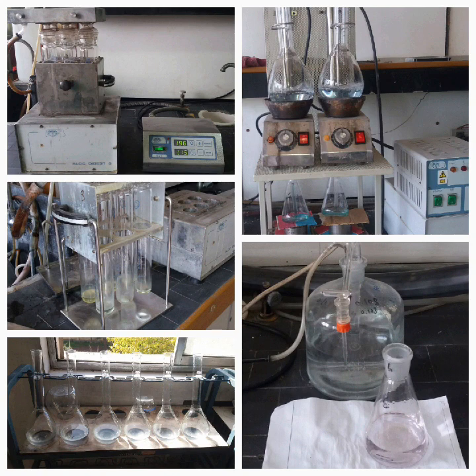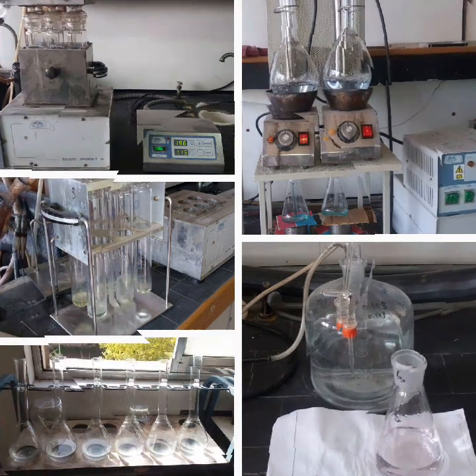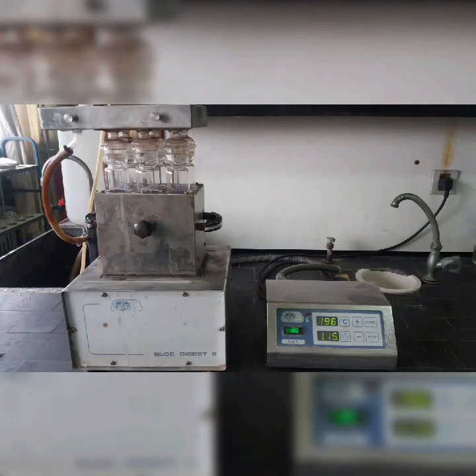Let's dive into the first stage, digestion. Imagine dropping your grain sample into a cauldron of concentrated sulfuric acid. Sounds dramatic, right? That's essentially what we do. This step breaks down complex organic matter so we can target just the nitrogen. Chemically, sulfuric acid acts like a powerful solvent, oxidizing everything but the nitrogen. That nitrogen is transformed into ammonia gas you probably remember from household cleaners.